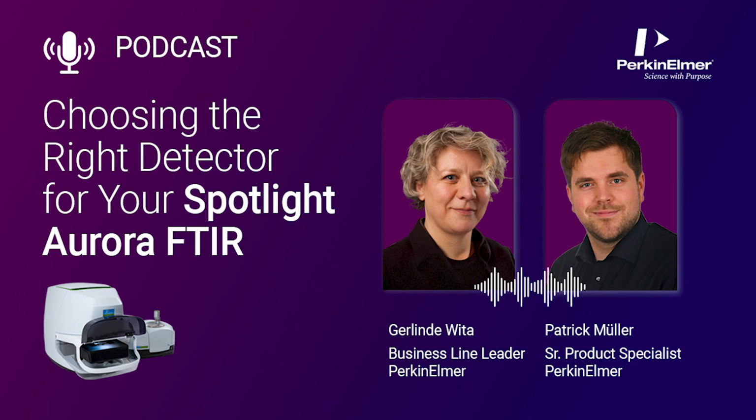Yeah, thank you, Gerlinde, and hello, everyone. As mentioned already, there's a range of detector options for the Spotlight Aurora system. Namely, in this case, there's two different varieties of MCT detector and an InGaAs detector for a different measurement range. And there's a few factors which will determine which detector you want to use.